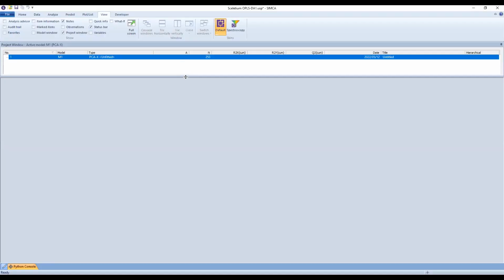Okay, we now have a PCA unfitted model, and then we auto-fit initially before we can do any scaling or any kind of transformation. In this case, we had 253 observations, which are the samples that we picked from the different provinces.